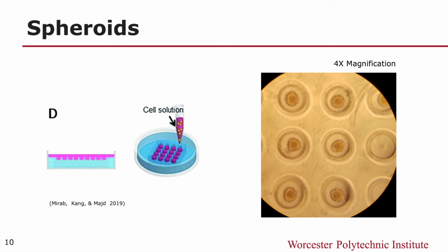Afterwards, the microwells can be loaded with a concentrated cell solution of approximately 1 million cells per mold. Spheroids begin to form after about 24 hours, but leaving them for at least 3 days in the microwells ensures that they will form strong aggregates.